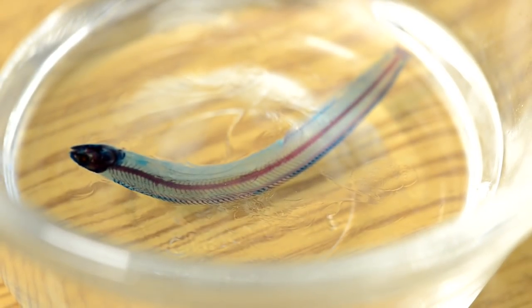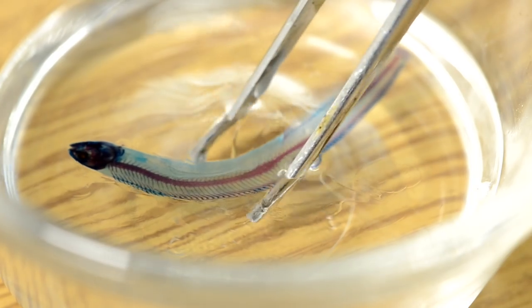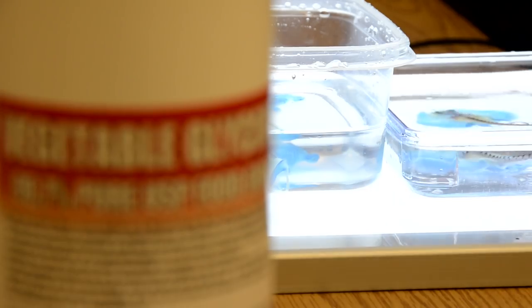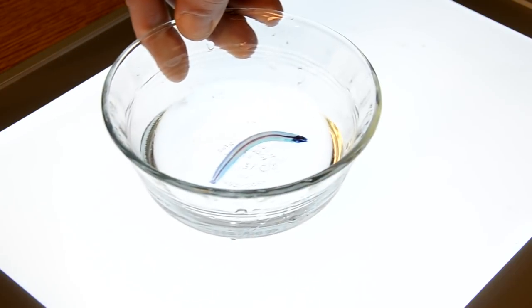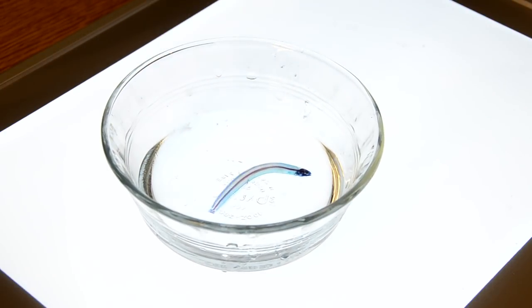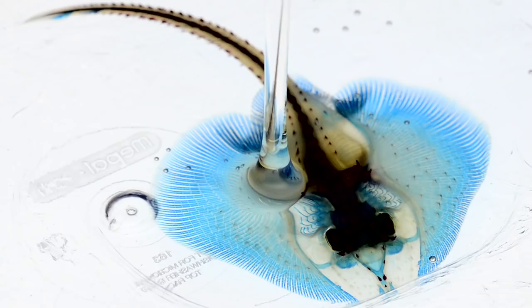Collagen, the stuff that's in your skin, holds the fish together. Then a little bit of bleach gets rid of the dark colors and you're left with a white fish. Collagen has the same index of refraction as glycerin, and by putting it in glycerin the entire fish becomes transparent with this beautiful pattern.